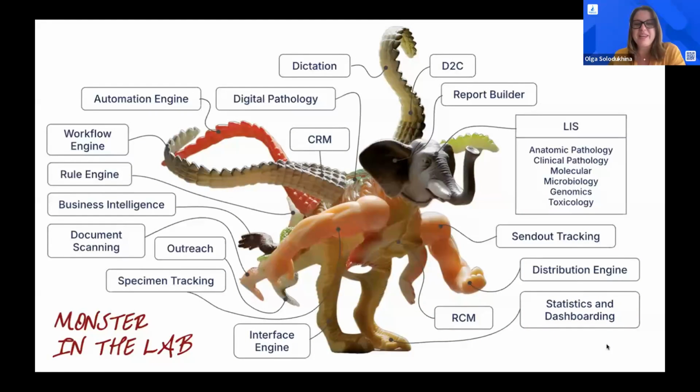Here you can see the processes that you might end up having covered by different vendors and different solutions. Instead of that, we offer a solution that covers all of these processes. LigoLab is an all-in-one solution that offers you one source of truth, and for any process you might think about in the lab, I bet 98% we cover that.